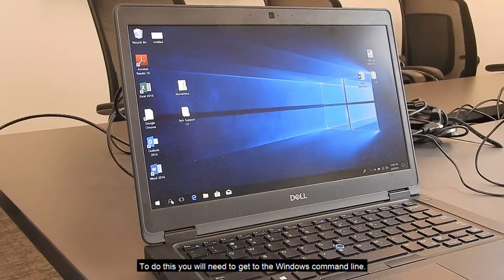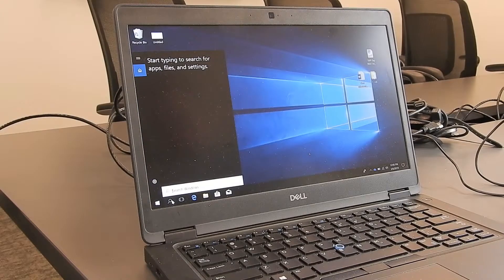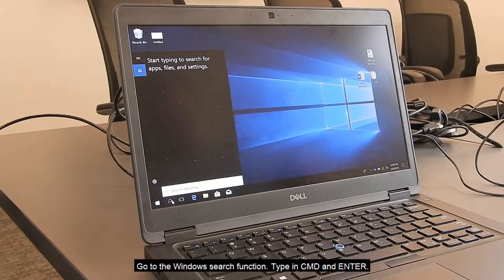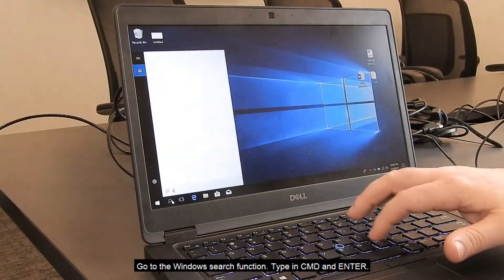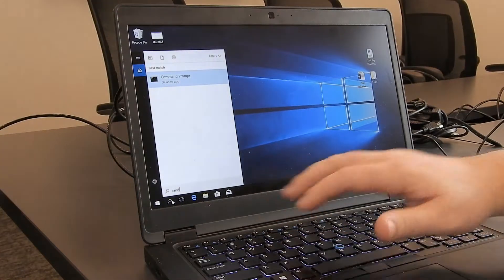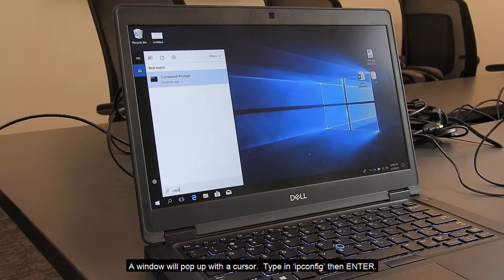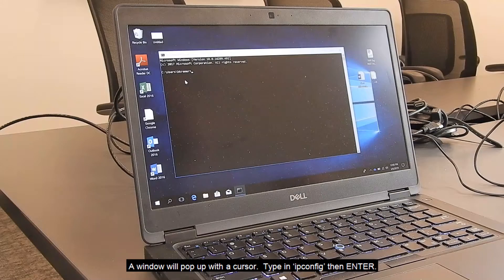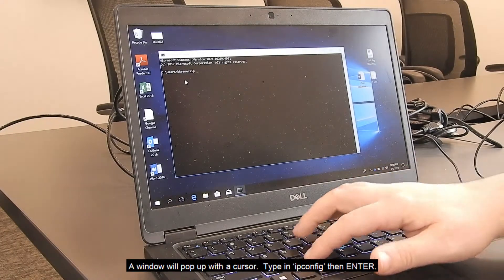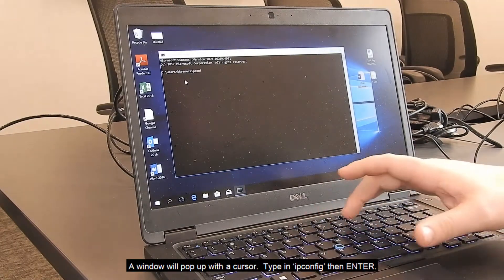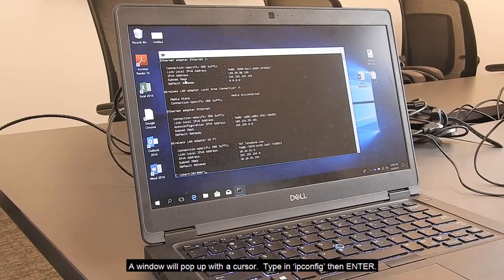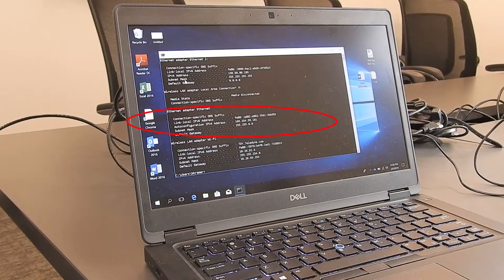To do this, you will need to get to the Windows command line. Go to the Windows search function, type in CMD, and then press Enter. A window will pop up with a cursor. Type in IPCONFIG, then Enter.